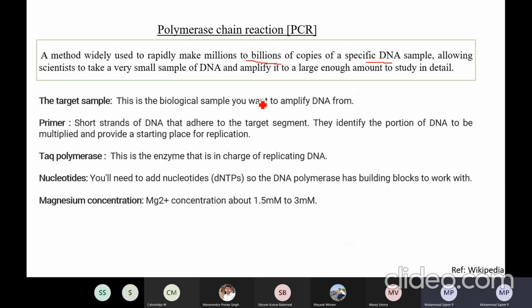That is an interesting fact. So in PCR, we usually use these terms, and I will just explain what they are. The primers are synthetic strands of around 18 to 25 nucleotides, which are complementary to the DNA target sequence we want to amplify. And two primers will be designed in PCR.